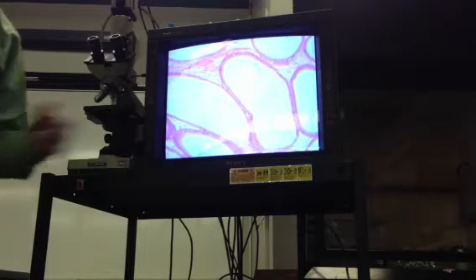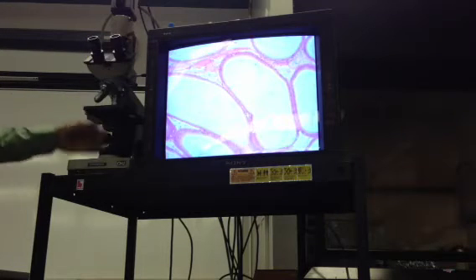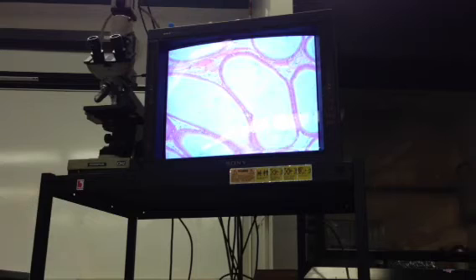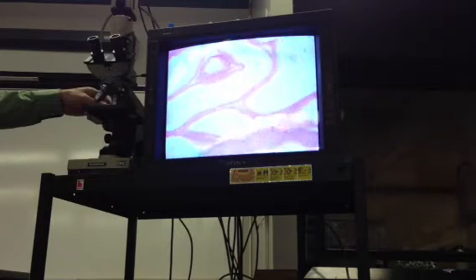The epididymis is really like a continuous tube that's very highly convoluted and ends up straightening out into the vas deferens. But you can see they're all filled with this stringy stuff. That's sperm. So that should be pretty obvious, the epididymis. There's nothing else that looks like that.